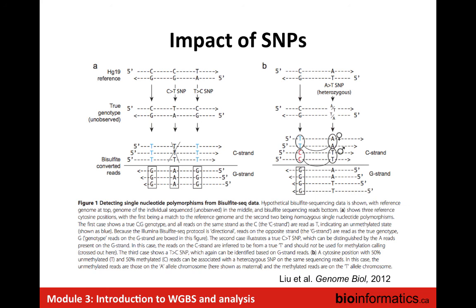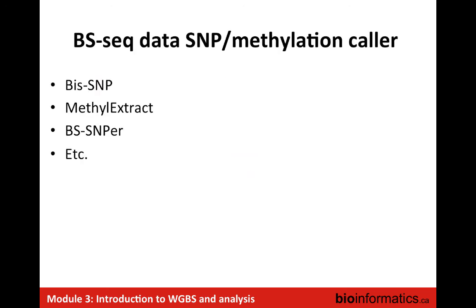Okay. Does Bismark and other aligners automatically correct this SNP problem, or do we have to do it manually here? So there are tools, which I have on the next slide, that really go in and extract the information of both the variants and the methylation status on these variants. Otherwise, again, you can input common variants and mask these regions before you do your DMR analysis, for instance. Typically, the output is going to be a straight output of the methylation status at these variant locations. It's just that the levels maybe will vary more at the location of these SNPs, but you have to handle that as a post-processing step in how you use the values there.